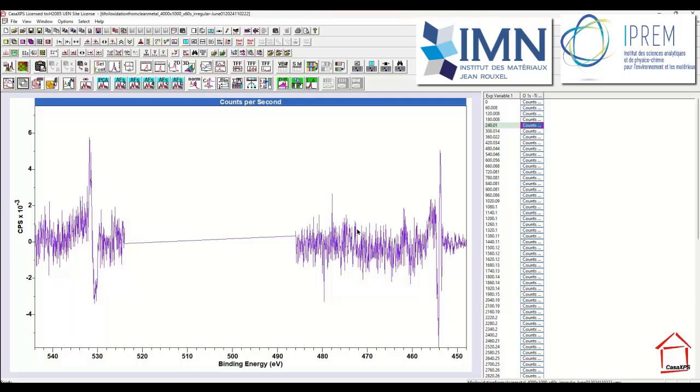So that's the basis of how you might use PCA and the reproduction of the data with PCA to improve the signal to noise in your data set as a whole. And this is important when we come to do difference calculations, because when you do a difference calculation, the difference between noisy data is amplifying the noise. So we really need to have the best quality data before we start performing difference calculations.